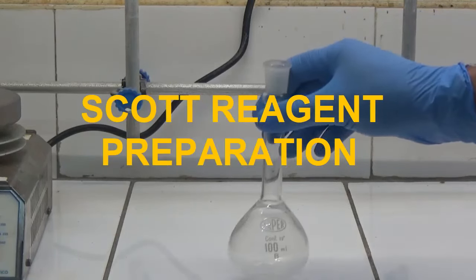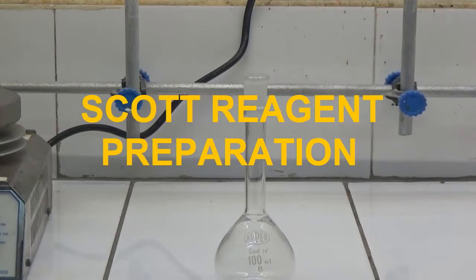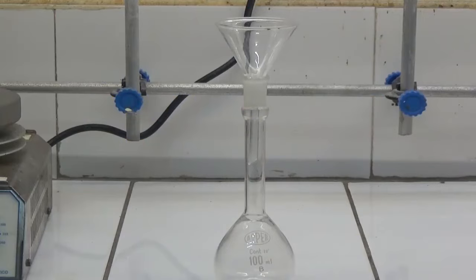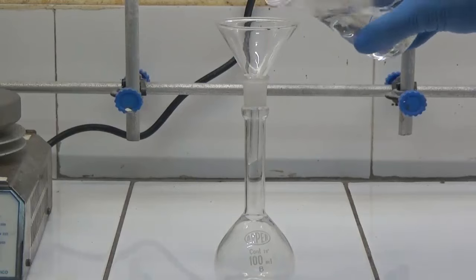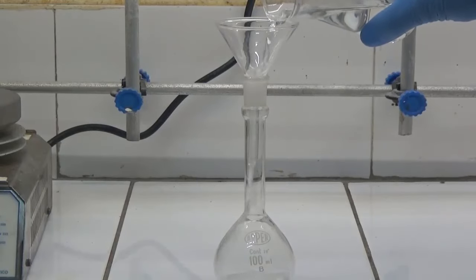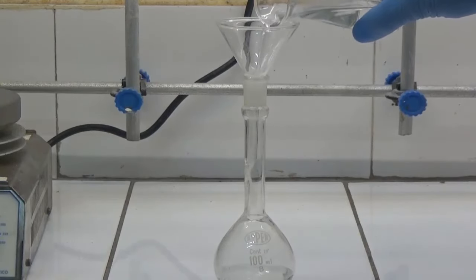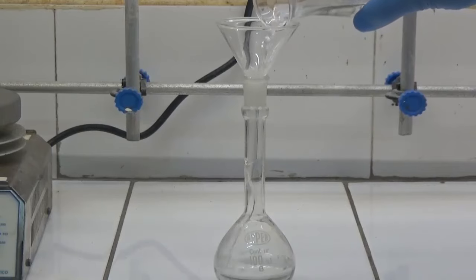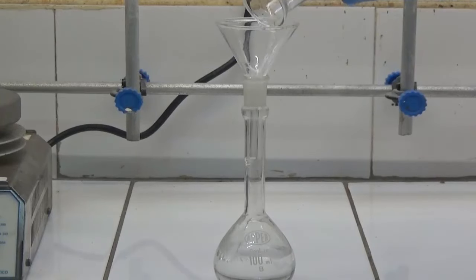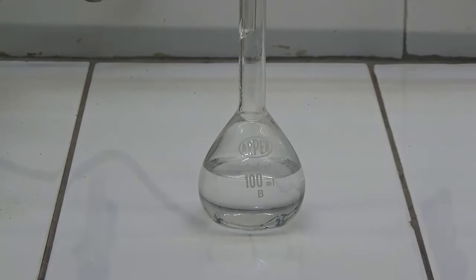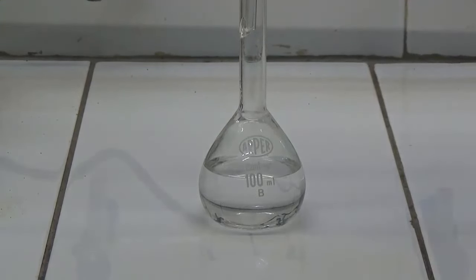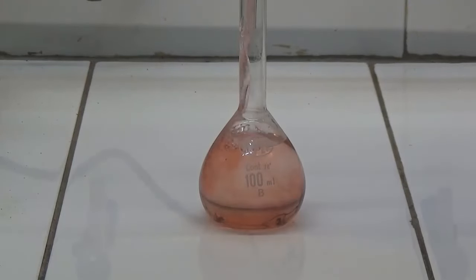Preparing the Scott reagent. In a 100 milliliter volumetric flask, add a solution of 6 milliliters of concentrated hydrochloric acid in 60 milliliters of water. Add up to 100 milliliters of cobalt thiocyanate solution and stir to homogenize.